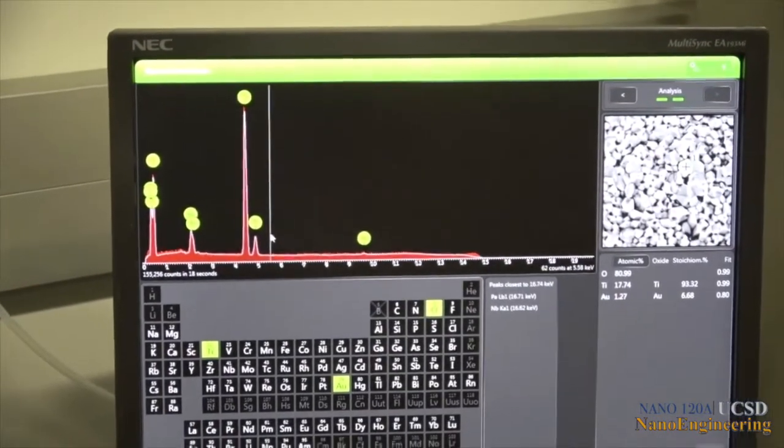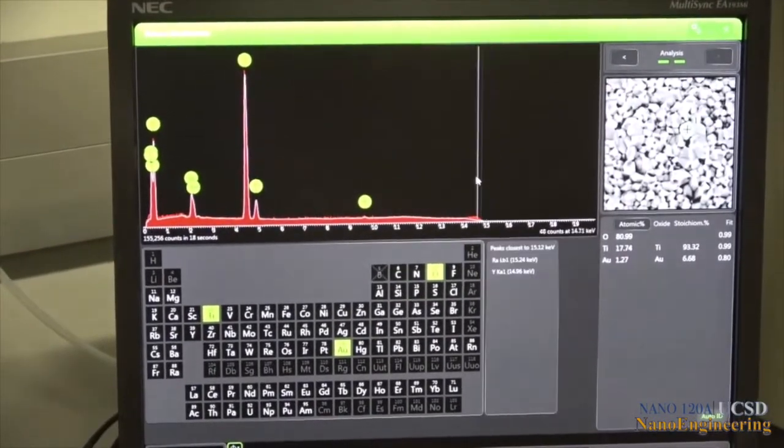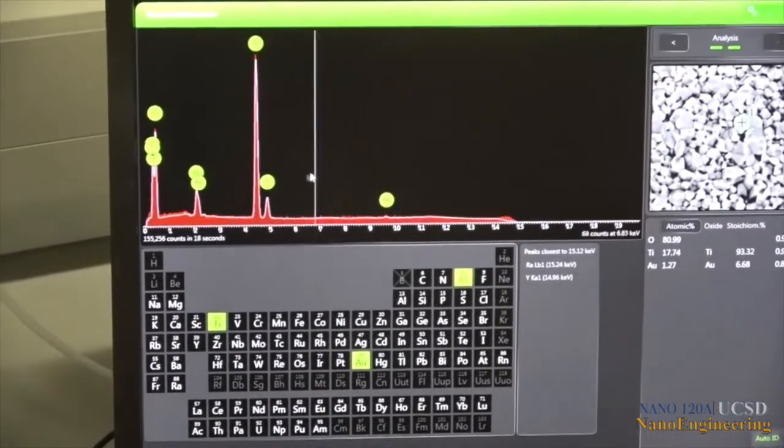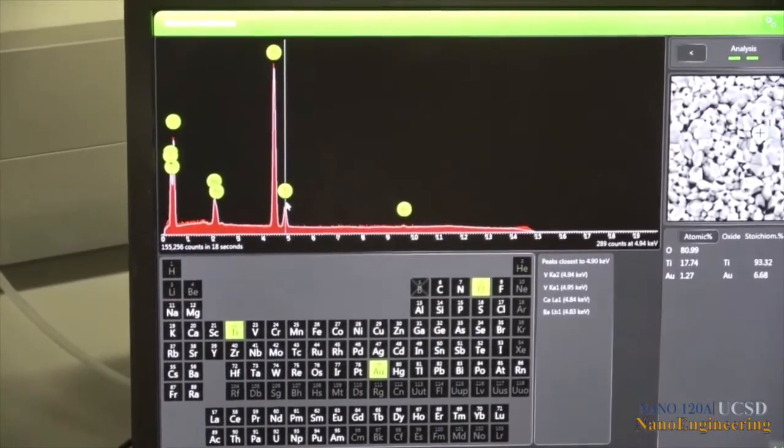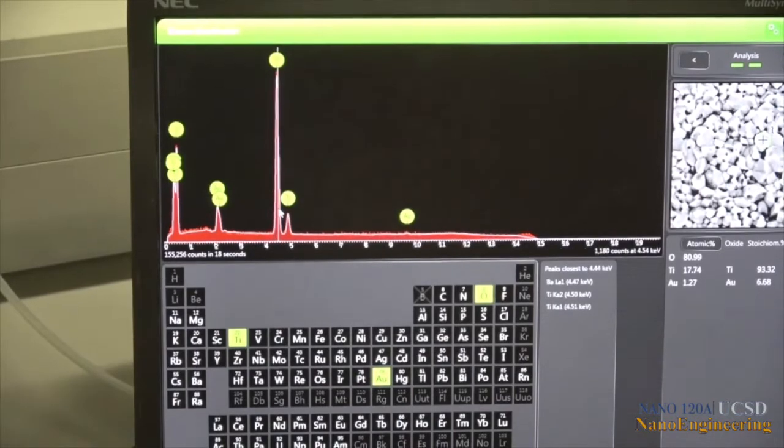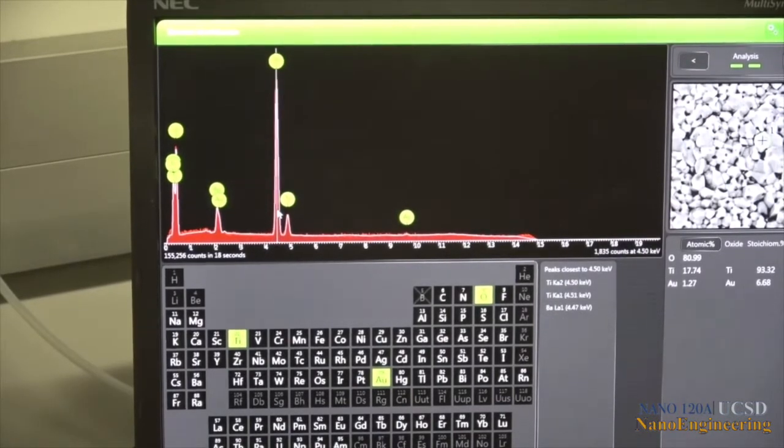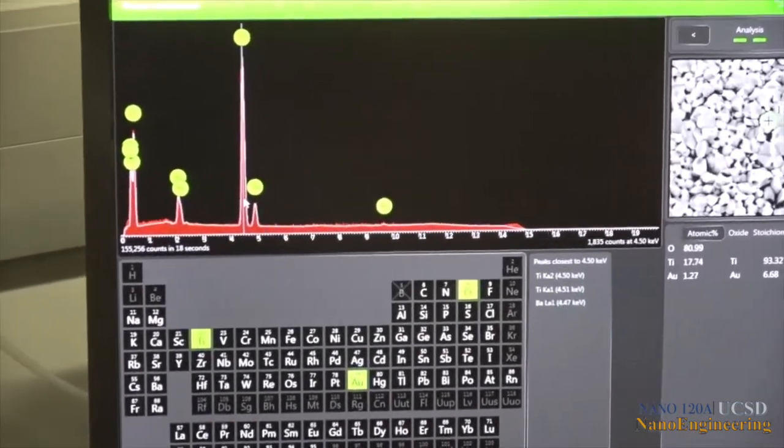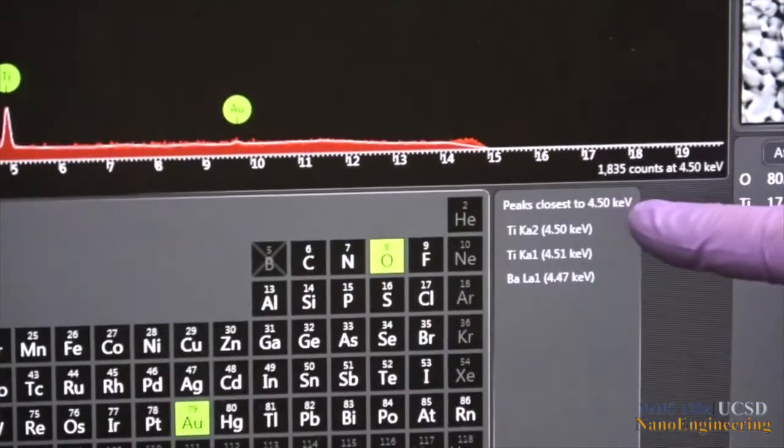Moving the cursor into the spectrum causes a vertical line to appear that can then be placed at various energies to see what elements may appear there, or in the case of a peak, what elements may be contributing to that peak or close to that peak in energy. This information is shown in the list to the right of the periodic table.